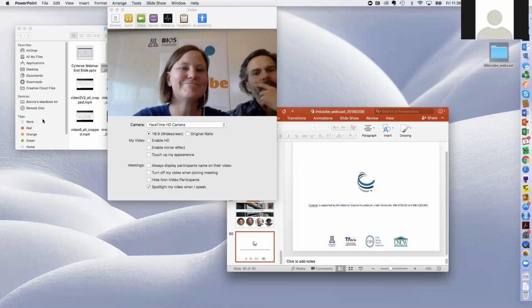We pretty much have what CAMERA had, and then we've added the Hawaii Ocean Time Series and a few other small data sets, the Ohana Gene Catalog. But we really haven't been able to curate and add an index, as she is describing, new data sets. But we are absolutely happy to integrate tools especially, that could be used to analyze those organisms, or that would be useful to those communities.